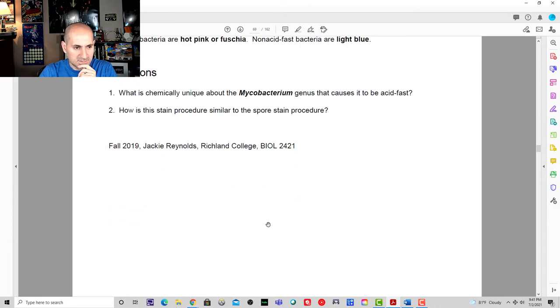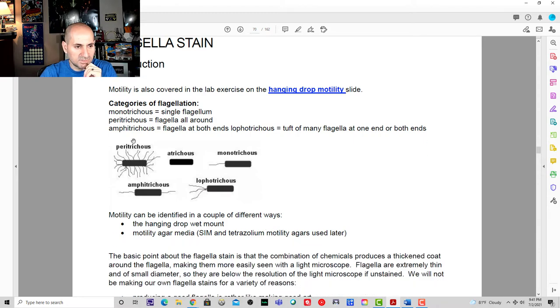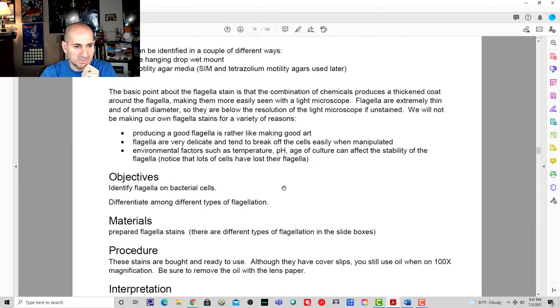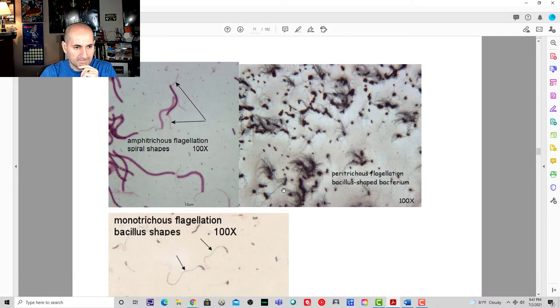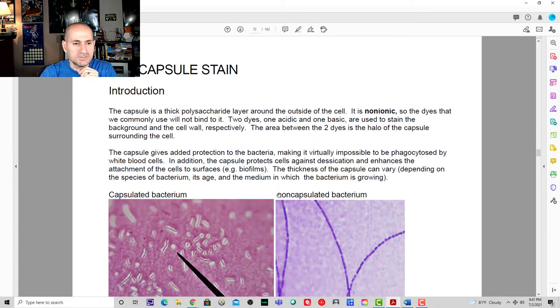Very good. And we talked about flagellar stains. Please know about these flagellar arrangements. Let's see, capsule stain. Let's know about the capsule stain as well. What do we want to know about the capsule stain?